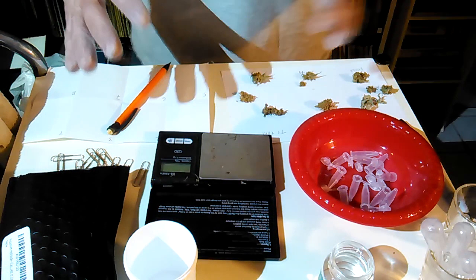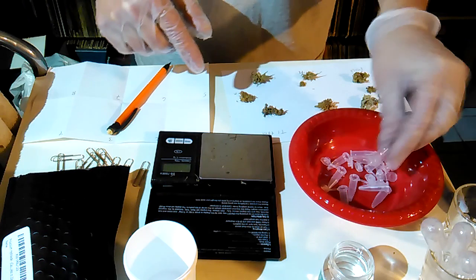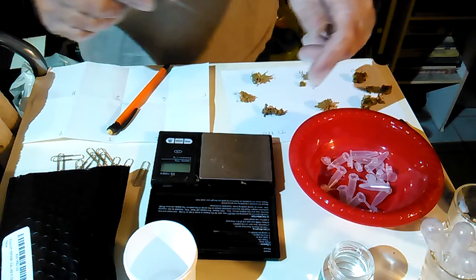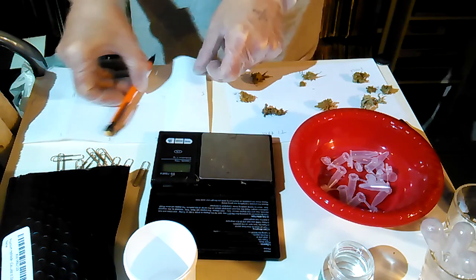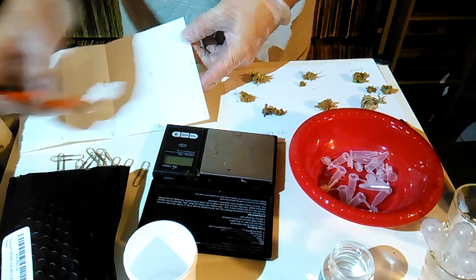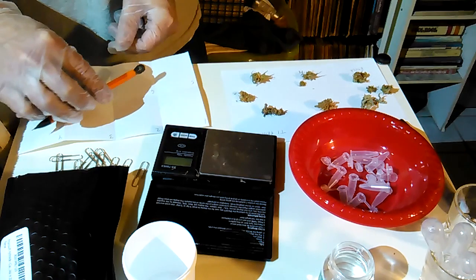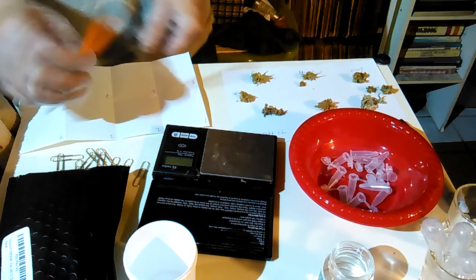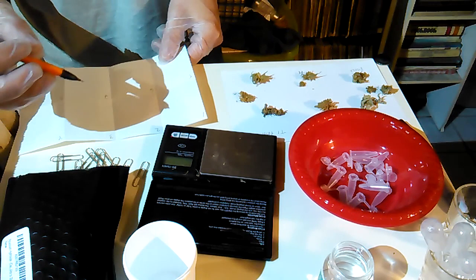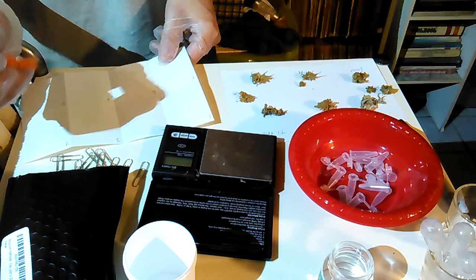The overall plan is basically to dissolve the samples in these little tubes with a small amount of rubbing alcohol. Then we drip a little bit of each of those on this paper in a little circle on each spot, and after it's dried, we're going to drip another substance onto those spots, and then it's going to react with the color that tells us about how much CBD is in each sample.